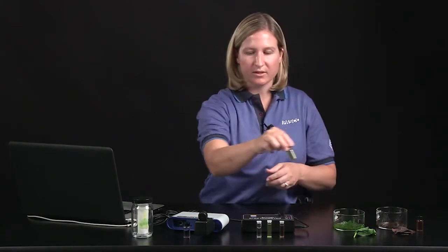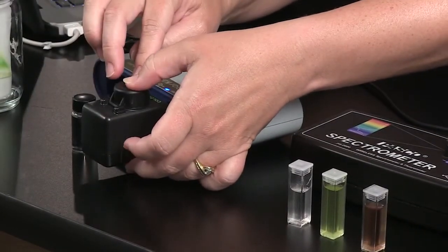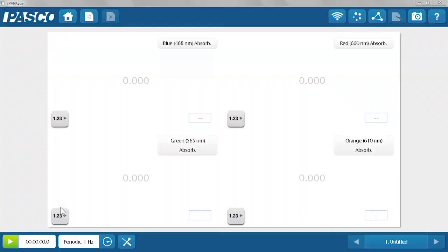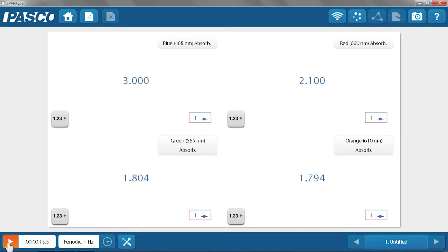Because my colorimeter is calibrated and ready to go, I can just take my spinach pigment extract, place that into the colorimeter, snap the lid closed, and hit record. I've created a page in SparkView that shows the four colors of the colorimeter. The lights within the colorimeter shine specific wavelengths of light through the solution, and the choices of light colors are blue, red, green, and orange. For plant pigment analysis, I like for students to look at all four colors for comparison.